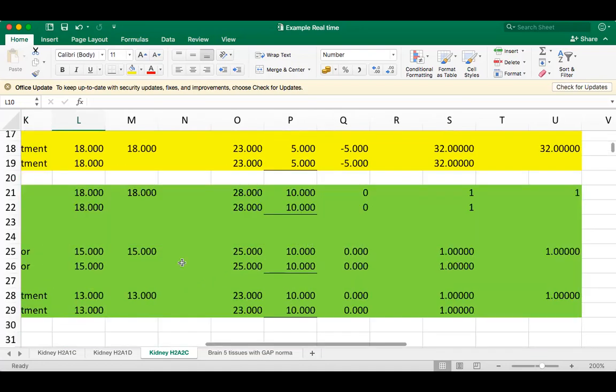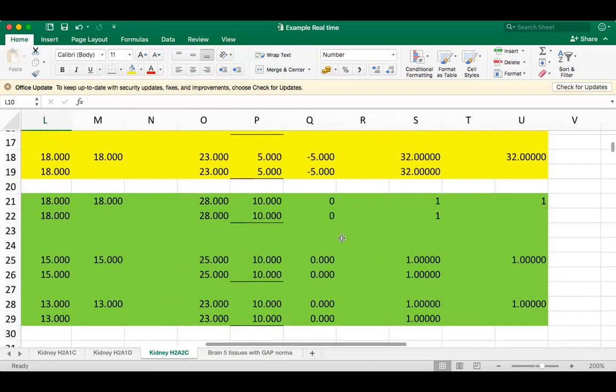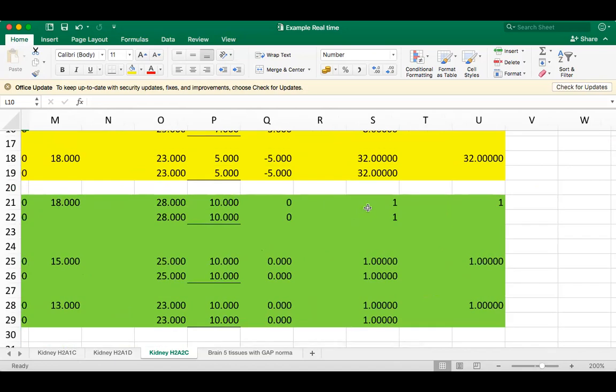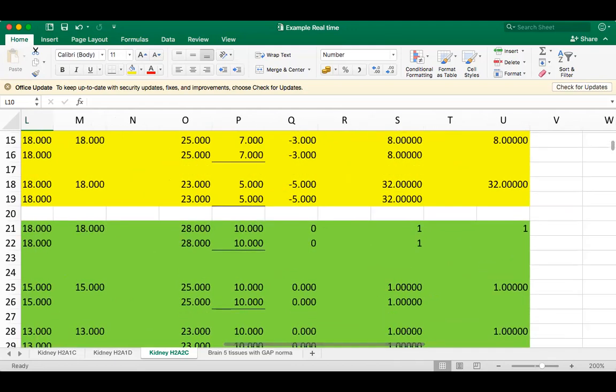So here we were talking about the second example where the value of the internal control gene itself is changing. When you calculate the difference, there is actually no difference. In all the 3 cases, there is an equal amount of DNA. So we just can't say that the higher expression is there. I hope everyone understood this example, or do you want me to go through it again? I think we'll go ahead with the rest of the presentation, Dr. Sanket. Okay, fine.